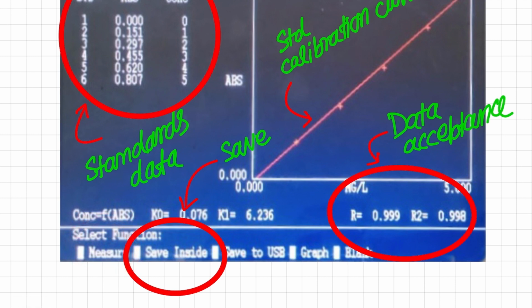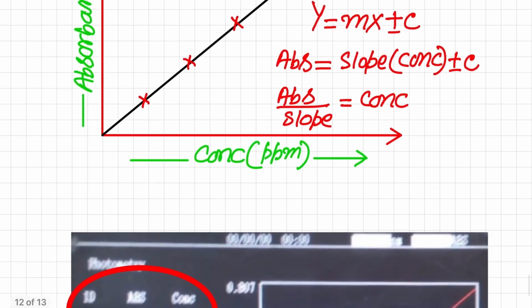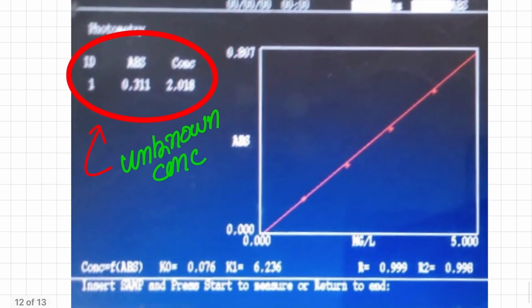So we press this measure button and then place the unknown concentration solution in the sample compartment with the sample cuvette side, and after that we press the start button, then we will get the unknown concentration of the solution.